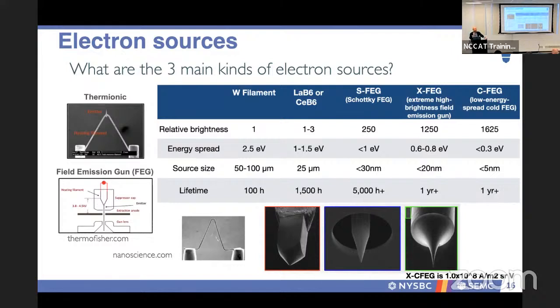So you want a very coherent beam such that you have your elastic scattering and all that contribution that's coming at your image plane is coming from your sample. But if different speeds are hitting the same sample, then you'll have shadow images at different planes, and then you'll lose some resolution.